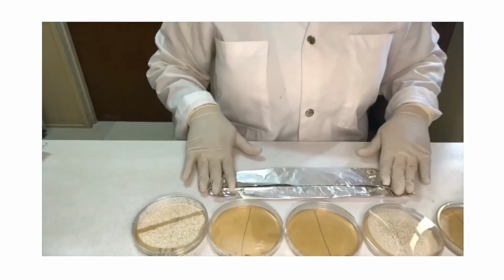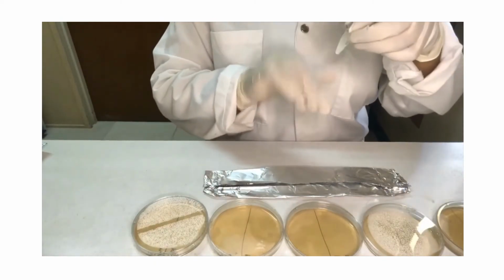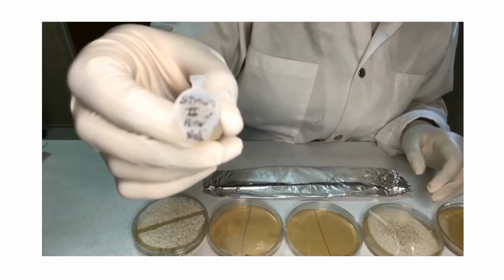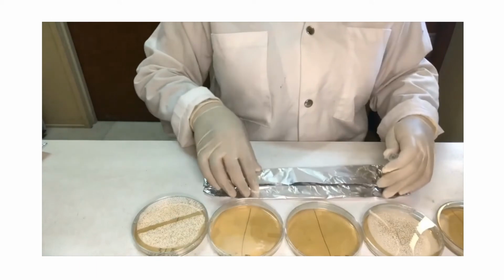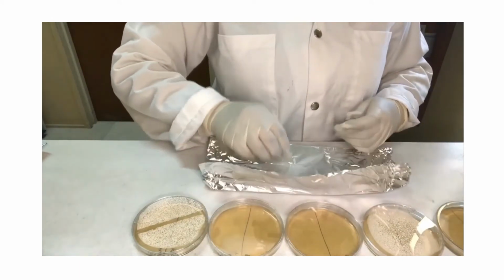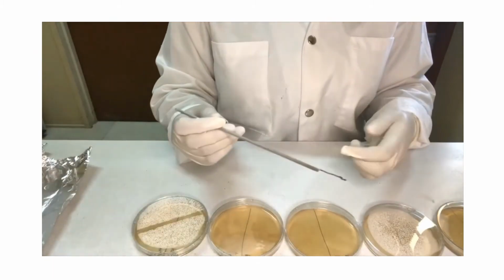The procedure is then repeated using bacterial strain 2. A second tube contains bacterial strain 2. Similarly, a sterile loop is used to collect a loopful of the strain 2 bacterial cells.